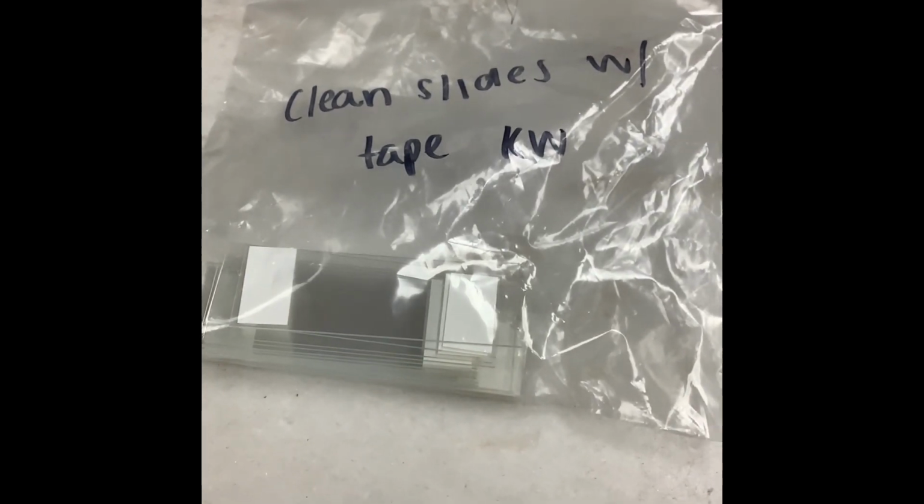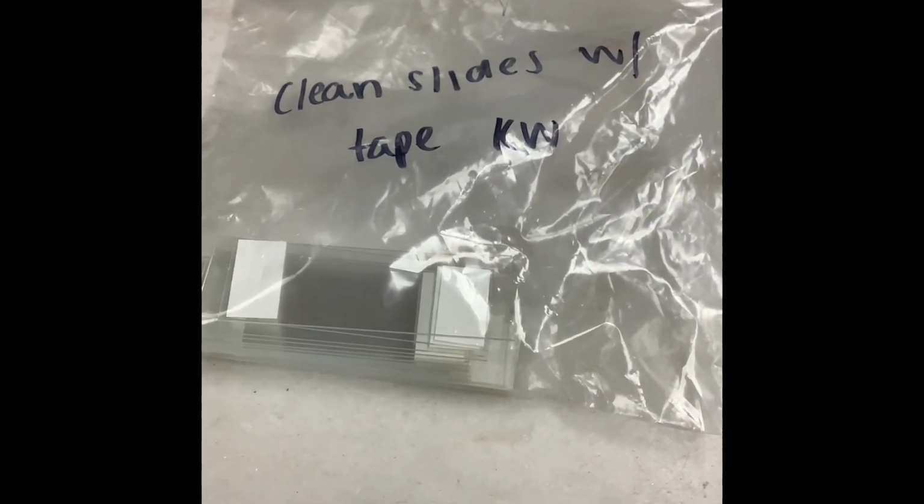Always wear gloves when you're touching your slides, especially your cleaned slides, and only ever grab them by their edges. And then lastly, store them in a plastic bag so that they don't get dust or anything else on them.